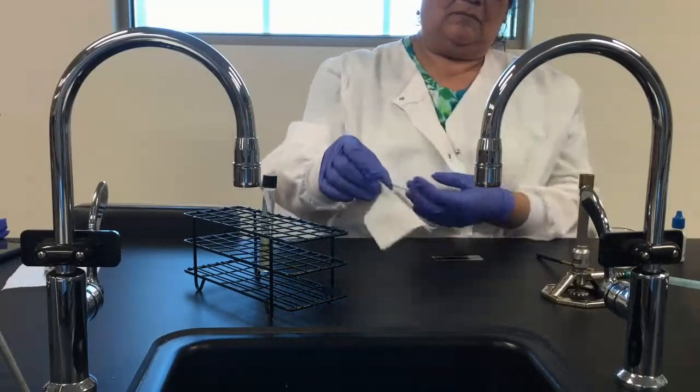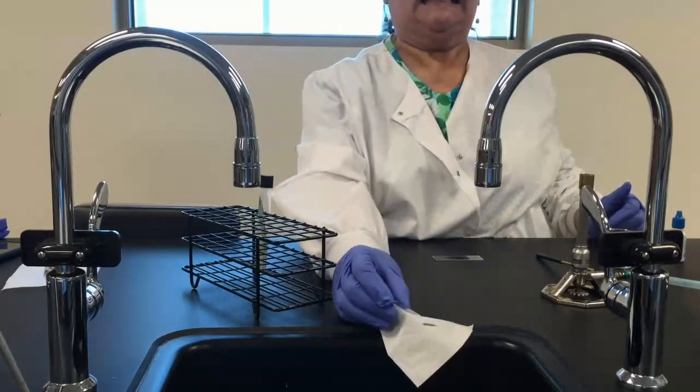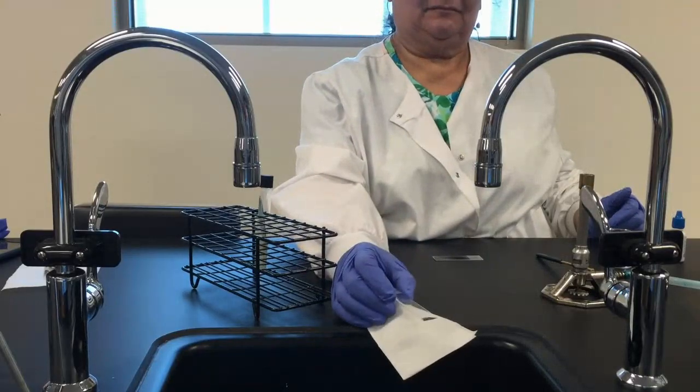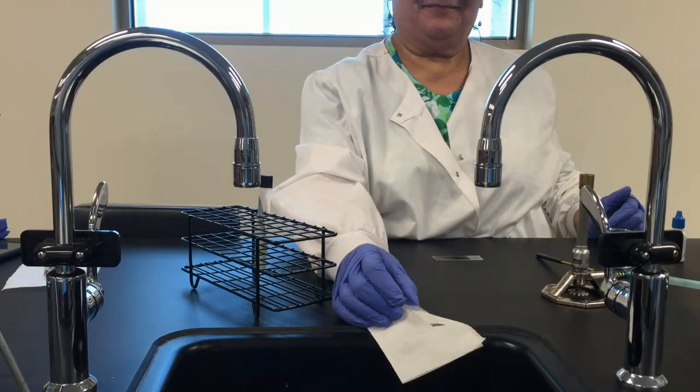All right, now once you've done that, you've got live microorganism on the end of that slide. So what you're going to do is give it a rinse with alcohol, and then wash it, and you can use it from there. We don't happen to have any alcohol with us, so we're just going to set it down in the sink for now.